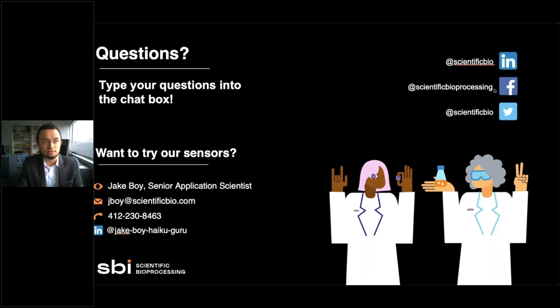Now, if it's of any use, I can definitely share that information. I can also confirm that according to those experiments, in their system at least, the core of the spheroid becomes fully anoxic after you go into the spheroid for 200 micrometers. That's what I can tell you about that phenomenon. But yeah, that's a very, very nice question to answer.